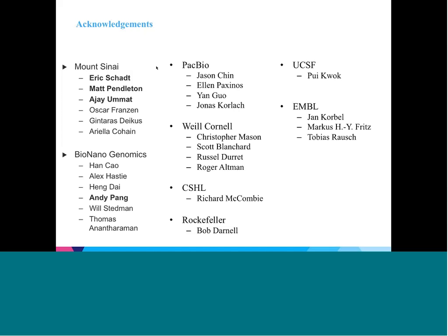And I will say that, for structural variation applications, we definitely do that. I don't want to indicate that we don't do that with long reads, just as people do it with short reads. We definitely do that. I was specifically talking about the way we did the hybrid scaffolding. We make a bunch of assumptions about coverage and symmetric coverage to make things work, and that's why I think that might not be tractable. Certainly for structural variation, the long reads work just as well as the short reads, and we've seen that in terms of seeing local rearrangements.